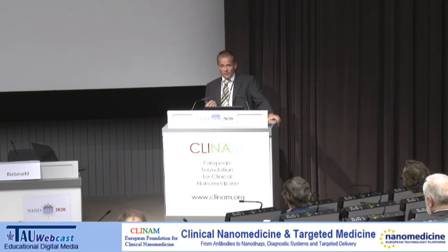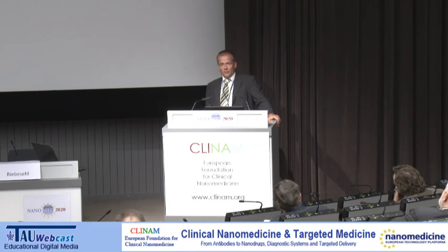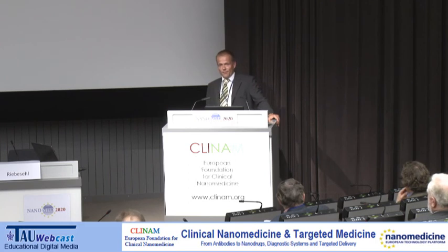So if we find poor solubility, or we get the information the drug has a poor solubility, we very often see the combination that also dissolution kinetics is very slow. In that case, actually, it's not always possible to tell if the solubility data we get from the colleagues in the characterization groups are real equilibrium data, or if it's simply so slow that they're not able to measure equilibrium solubility. In such cases, it's imaginable that, of course, by improving the kinetics, you can improve the levels of then absorbance in vivo also.